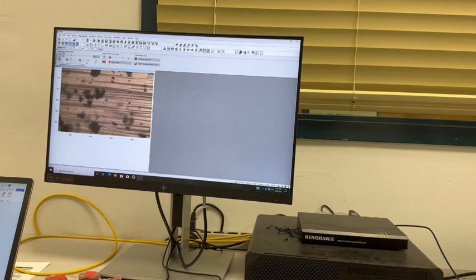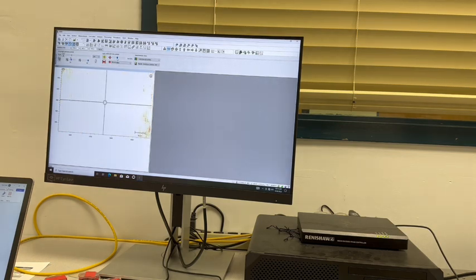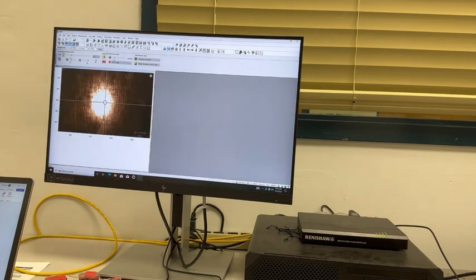Next, in the software, click the button that allows you to view both the laser and the sample and turn off the light. Lower the laser power down and then open the laser shutter. This will shine the laser onto the copper sample. You may want to close the pinhole and lower the laser power significantly to see where the laser is shining on the sample.